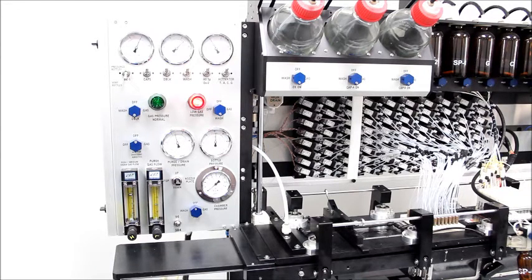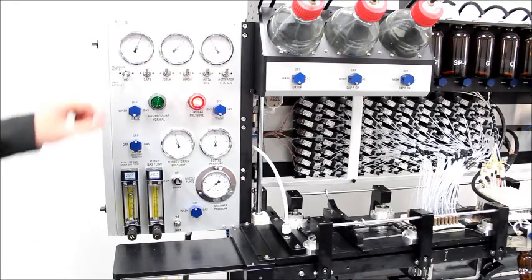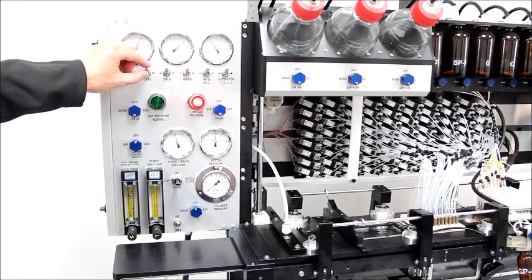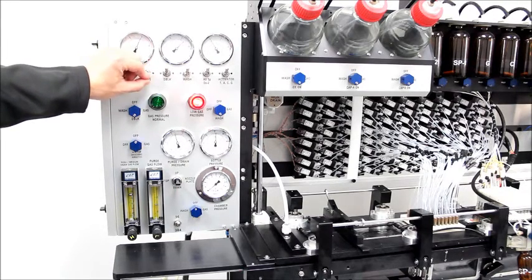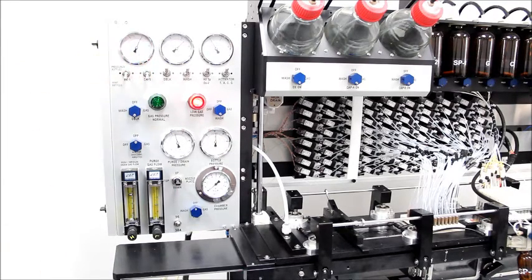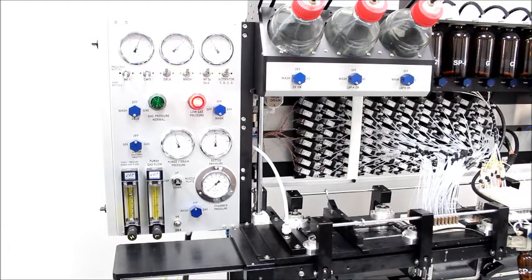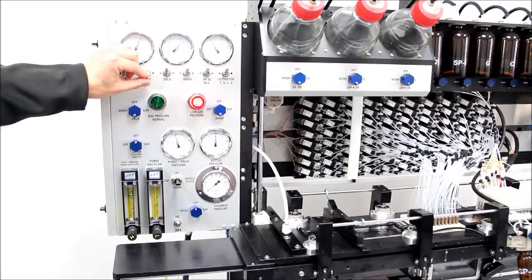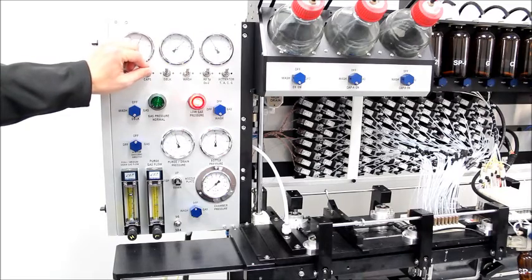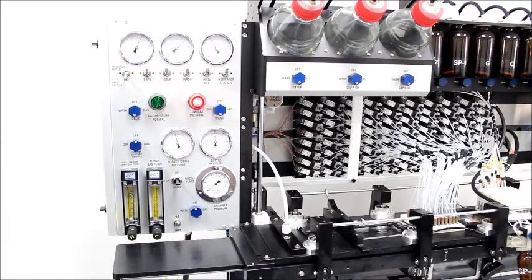When it's time to change a reagent bottle, the existing bottle may be vented by flipping this switch down, at which point the old bottle may be removed. After the new bottle is installed, flip this switch up to pressurize the new bottle.